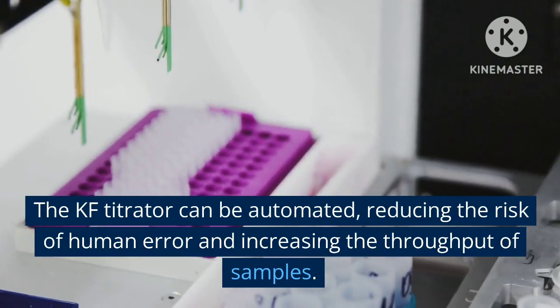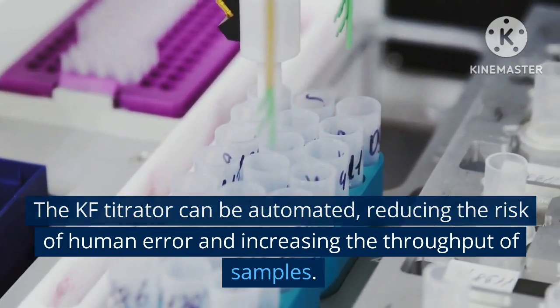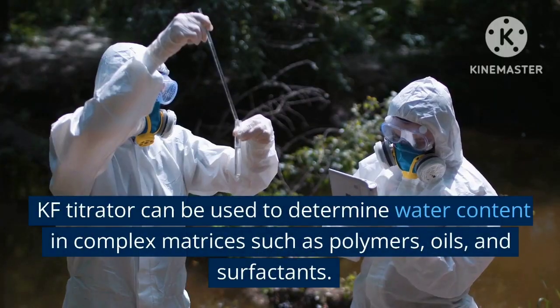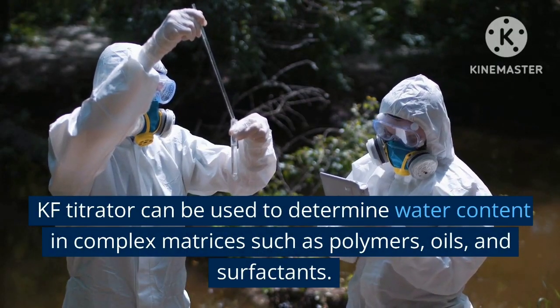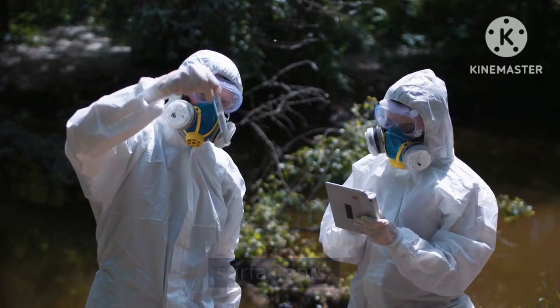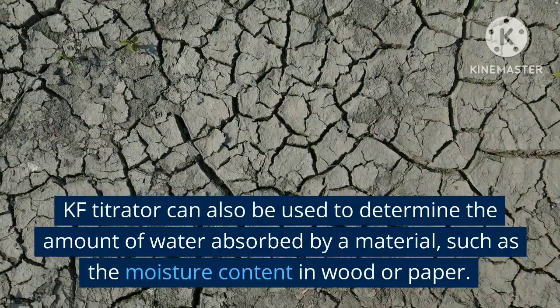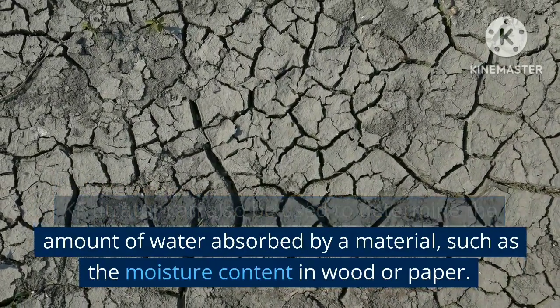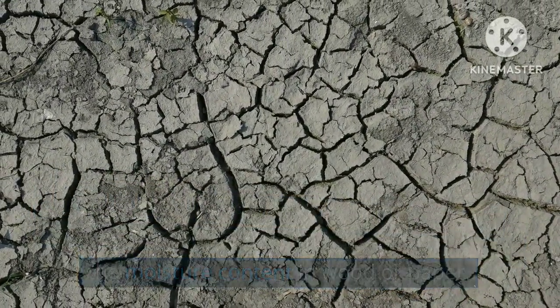The KF titrator can be automated, reducing the risk of human error and increasing the throughput of samples. KF titrator can be used to determine water content in complex matrices such as polymers, oils, and surfactants. KF titrator can also be used to determine the amount of water absorbed by a material, such as the moisture content in wood or paper.